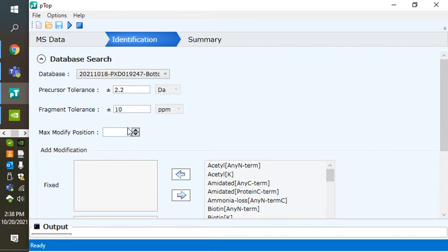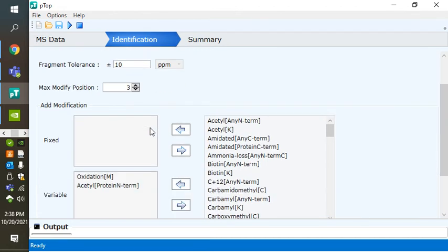So we have to be kind of careful that this number is high enough, but not too high. Where that sits is a little tough to know. The cost of setting it too high is not just a slow search, it's also one where you've compromised your specificity.